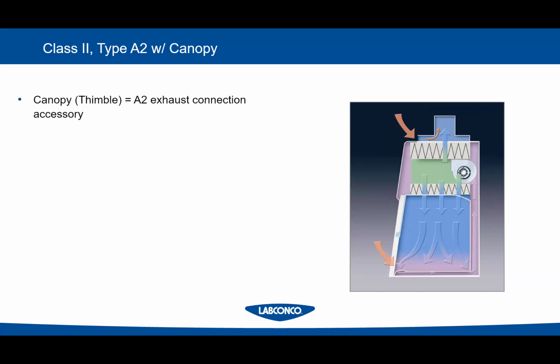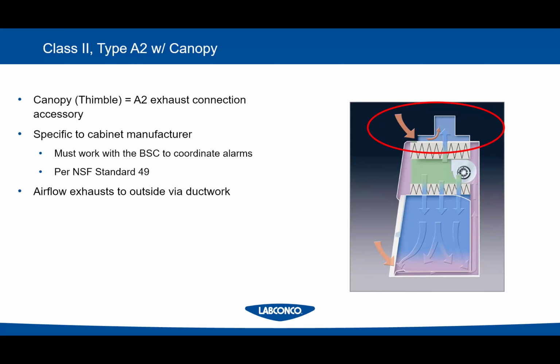Because first and foremost, an A2 biosafety cabinet is made to maintain biocontainment. If I have an exhaust failure in the building, that air is going to come back out this canopy into the lab, because its core function per NSF is to maintain biocontainment, right? That is its first and foremost goal. So this is how we start to think about chemical use and volumes, and how we do our risk assessment, right?